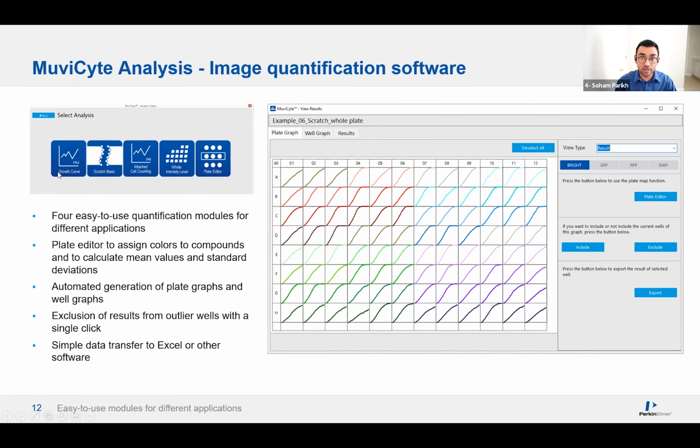So if you wanted to monitor any cell confluency or cell proliferation or something of that sort, you can use that mode to analyze those details from your cells. You can also get scratch assay analysis done from that. If you had any scratch tests going, you would have the ability to quantify all the details from your own computer if you wanted.